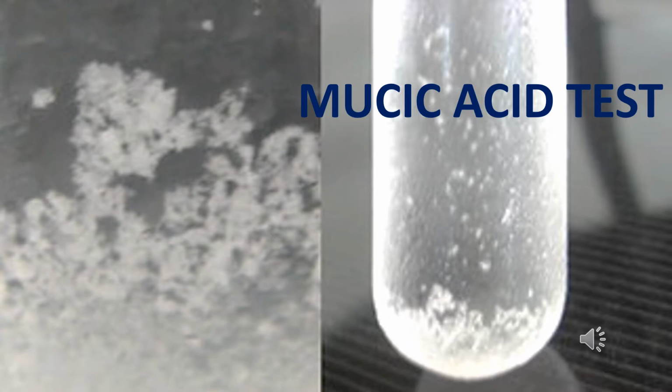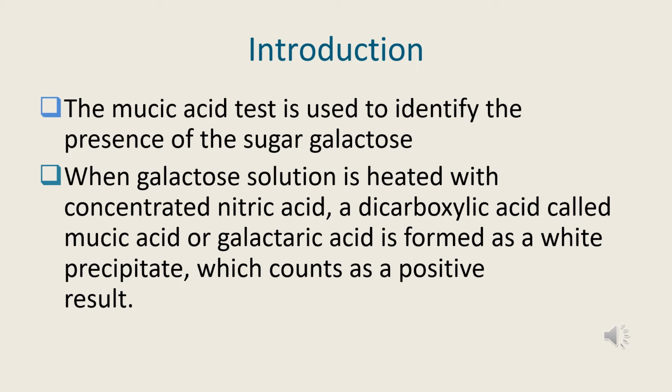Test for galactose, mucic acid test. Introduction. The mucic acid test is used to identify the presence of the sugar galactose. When galactose solution is heated with concentrated nitric acid, a dicarboxylic acid called mucic acid, or galactaric acid, is formed as a white precipitate, which counts as a positive result.